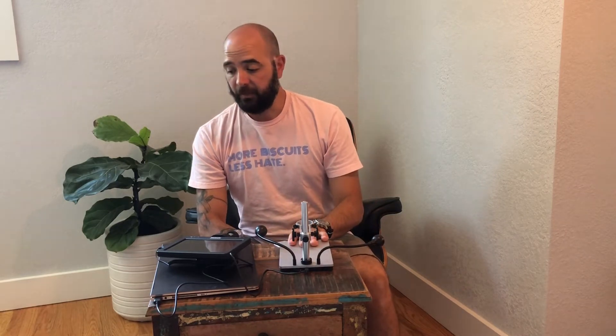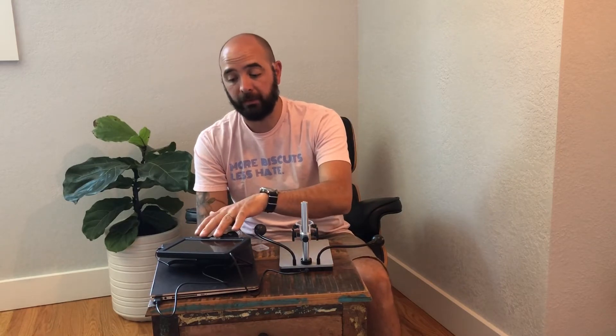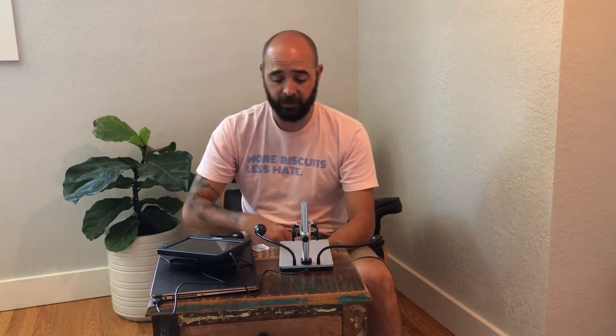We just got this really great digital microscope. It hooks up to your computer and also comes with a provided memory card. It's not just your typical standard microscope — it's hooked up to a really beautiful LED screen, has a digital display, everything on it is digital, and it works either in conjunction with a laptop or on its own.